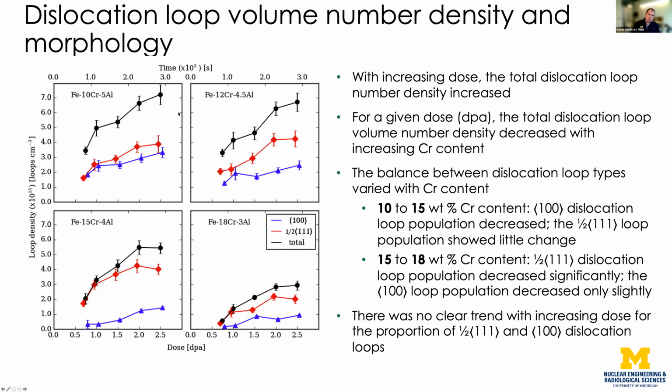The cool thing here is that you can clearly see that going from something that has about 10% chromium in its matrix to just about doubling that, you suppress the density of defects significantly, by a factor of about 2. So from these in situ irradiations you can determine compositional effects as well as the dynamical effects in the process. That's the really cool power of the whole process here.